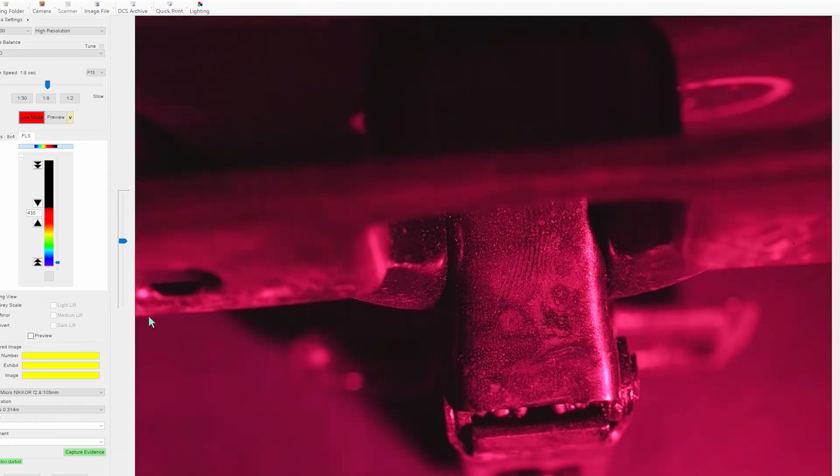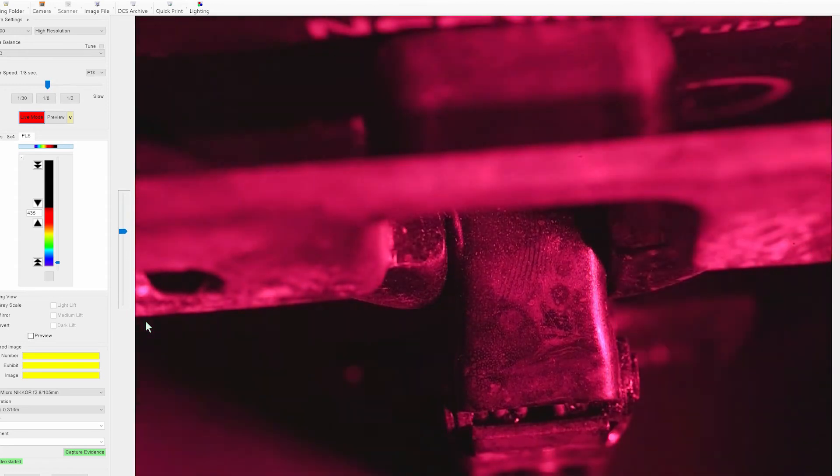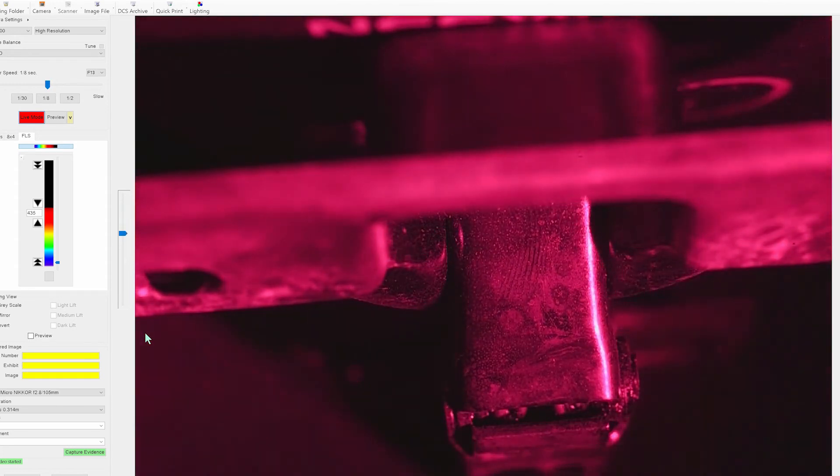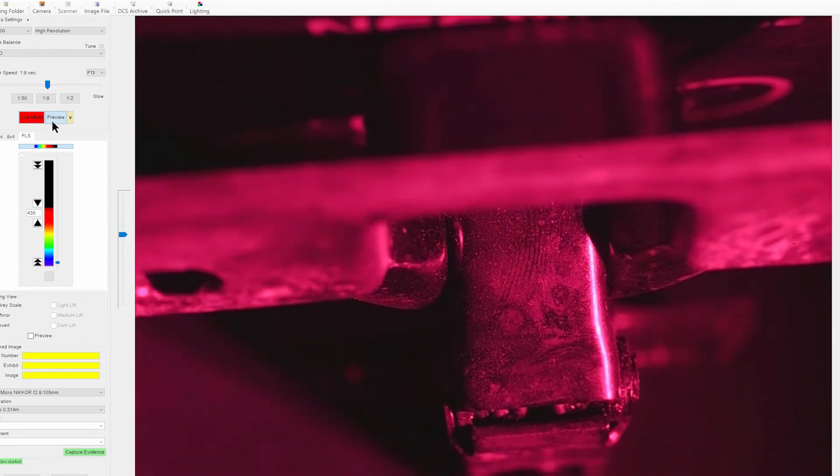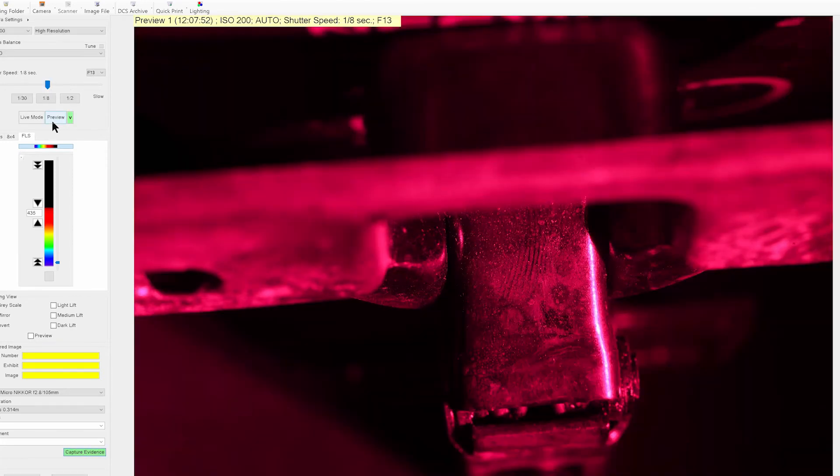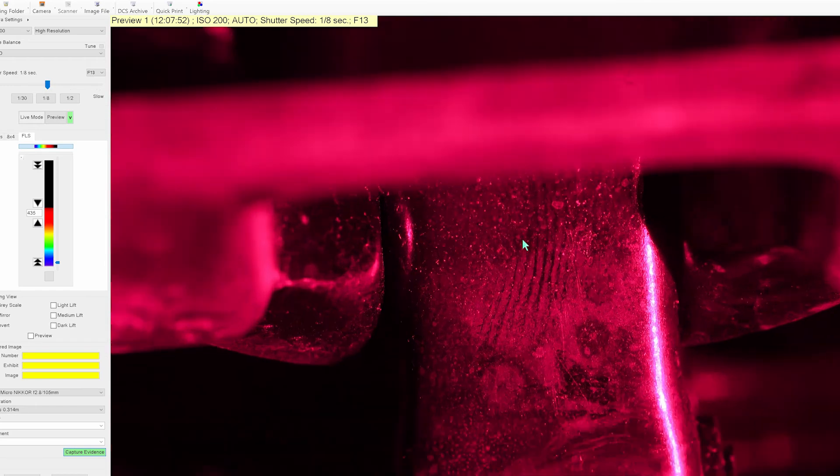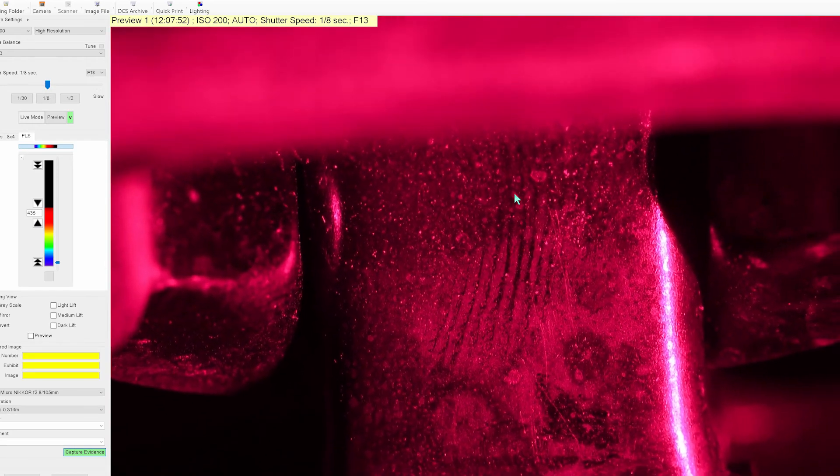Now with reflective UV it's important to get the right angle and the right intensity of light. Once we're happy with the image we take a preview and then we can start to see our partial finger mark which has developed.